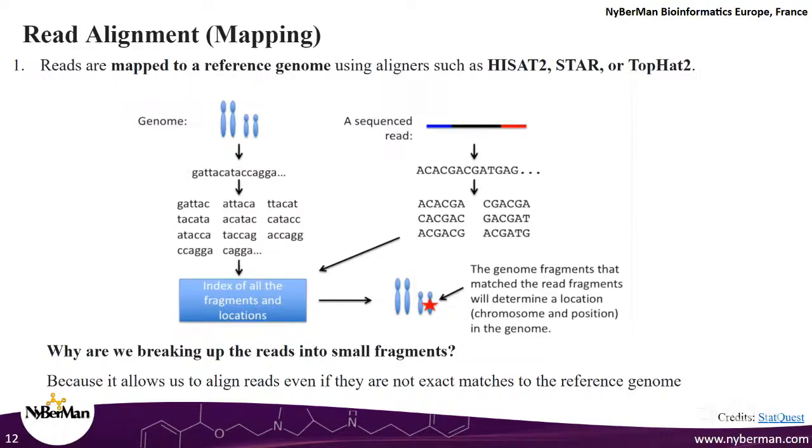Now, these read fragments are very small in comparison to it. The human reference genome is 3 billion bases, and each of your read fragments in short read sequencing is something around 100 to 200 or 300 bases. Now it falls on you as the bioinformatician, the analyst, to figure out from where exactly in that long thread that small piece of 300 bases originates. So what you do is something known as string matching.